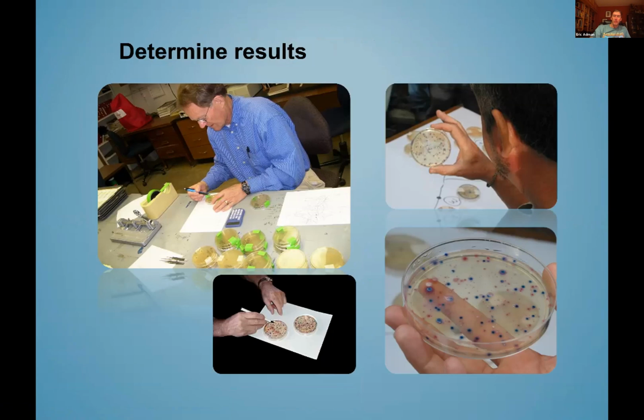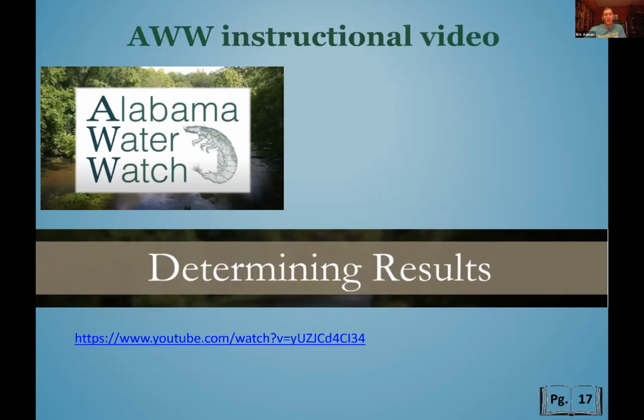Then the next thing you do, once you've incubated them, is count the colonies and determine your results. There are some particular ways to do that to make it easier. So I'm going to share with you a video on determining results.